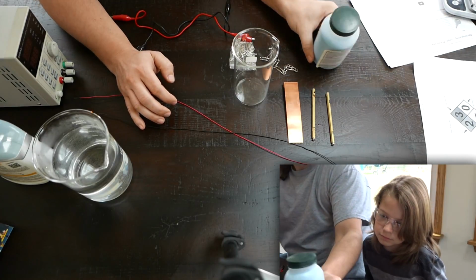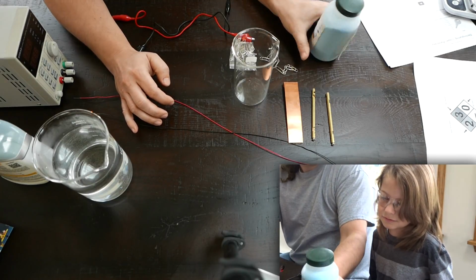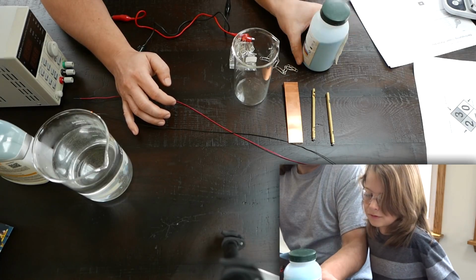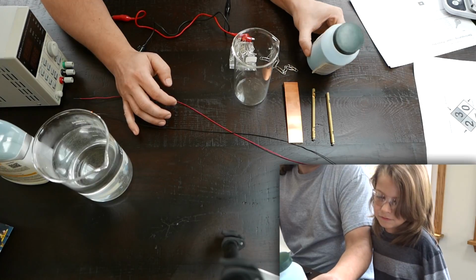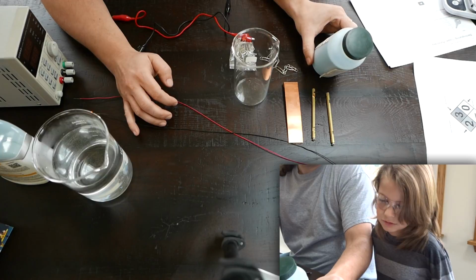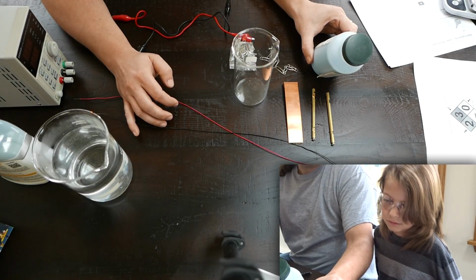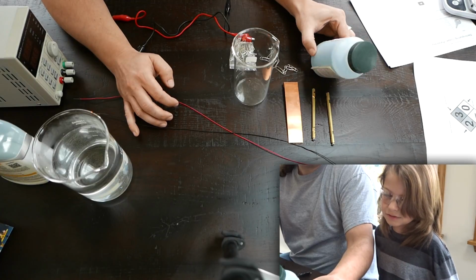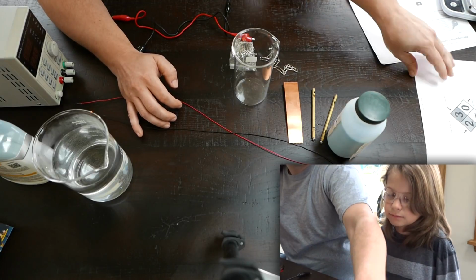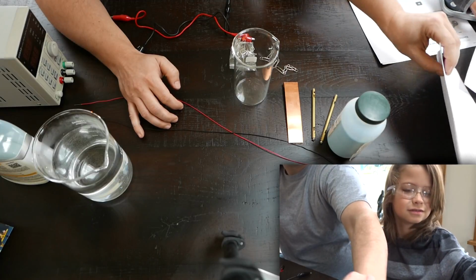So what do we got here on the side there? What does it say? Health, flammability. What color is the health? So everybody see what we're looking at here. Health, blue. Okay. Health is blue, but there's a number next to it. You see the numbers? 2. Okay. Flammability, red, 0. Reactivity, yellow, 0. Okay, so those numbers have meaning. So let's read what these. Oh, so this tells us what the numbers mean.